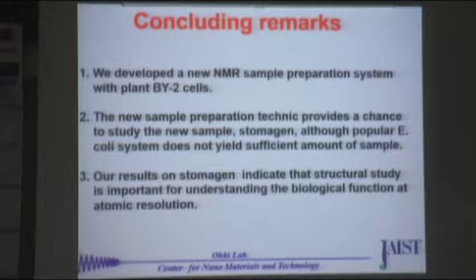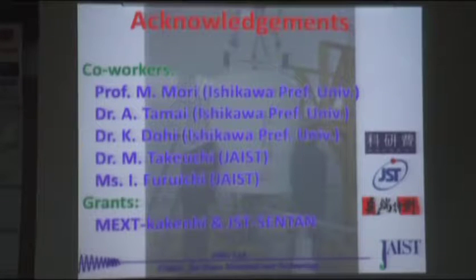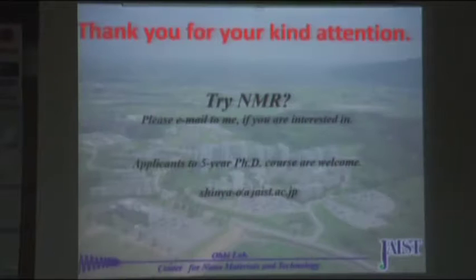So this slide shows the concluding remarks of my talk. We developed a new protein expression system using BY2, and the new sample preparation technique provides a chance to study the new sample stomagen. And our results talked about here indicate that structural biology is important for understanding the biological function at atomic resolution. So these are my collaborators, supported by these grants. And thank you very much for your kind attention.